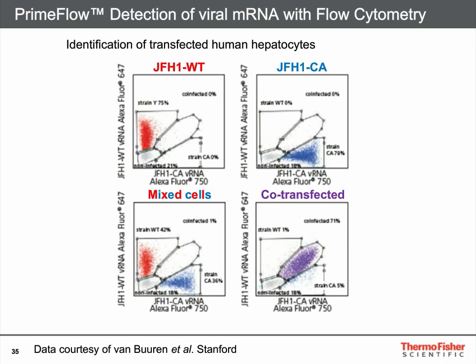And on the bottom, we can see that we can mix and match those two conditions and identify not only which cells, but quantitatively, how much of that messenger RNA is present in our cells of interest. And this is often before protein has even been produced. So this can be useful upstream for analysis of introduction of CAR Ts.